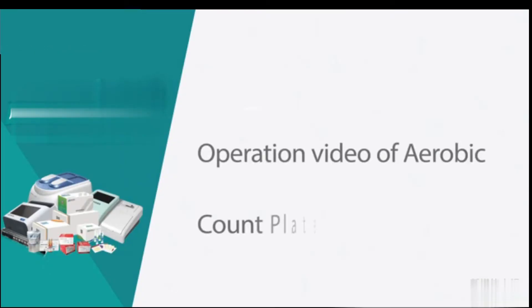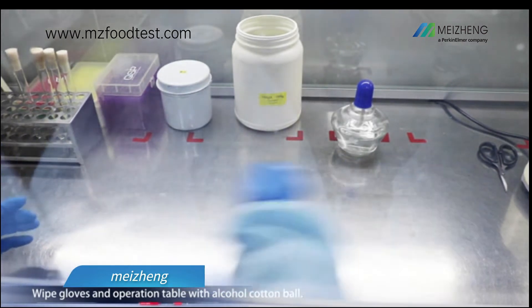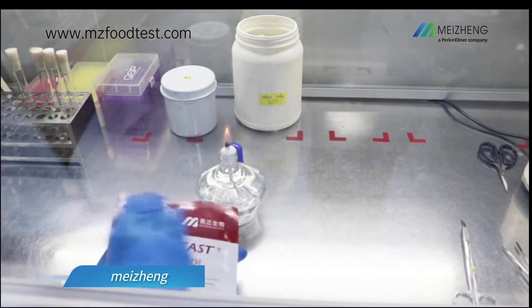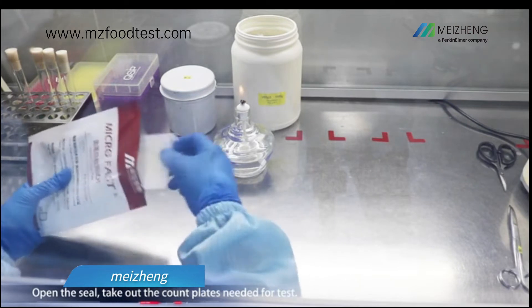Operation video of aerobic count plate. Wear lab coat, mask, and gloves. Wipe gloves and operation table with alcohol cotton. Light the alcohol burner. Wipe the packaging and open the seal, then take out the count plates needed for the test.